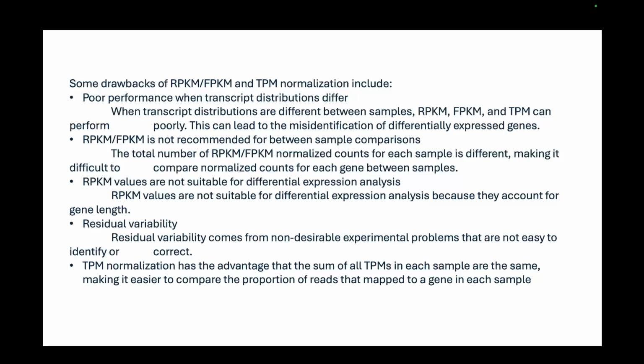Now, if you use different coverage metrics for both, so you have done the sequencing for these two groups separately, one will have a higher coverage and one will have a lower coverage. I'm not saying it will happen, but if that happens, the transcript distribution between the two types of samples varies majorly. In one you'll have a higher range for the transcript levels, and in the other you might have a lower range of levels depending on the coverage.